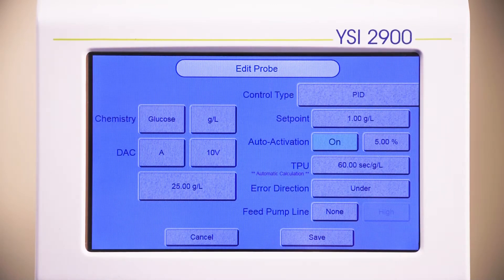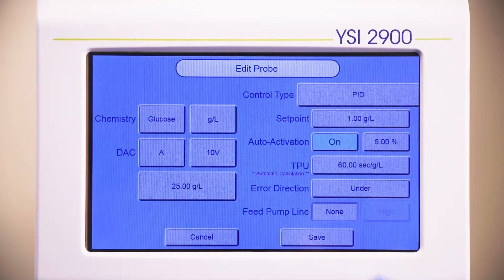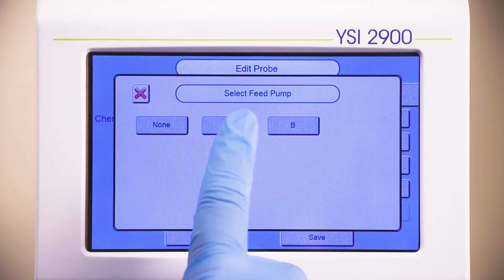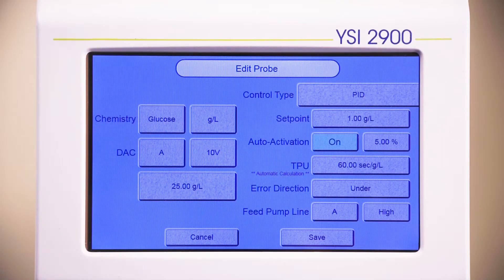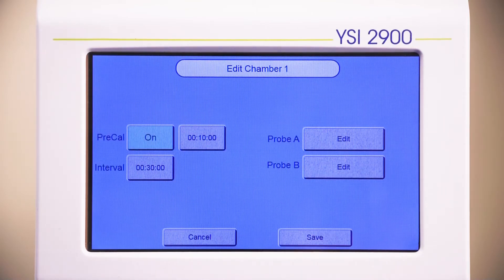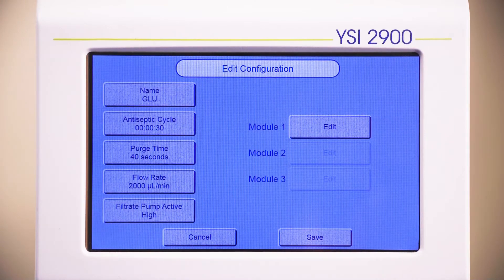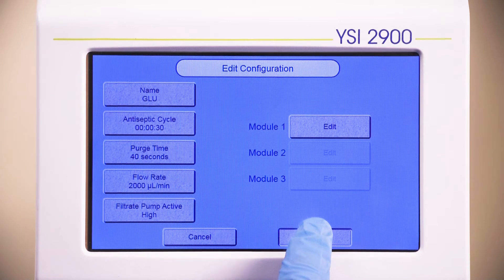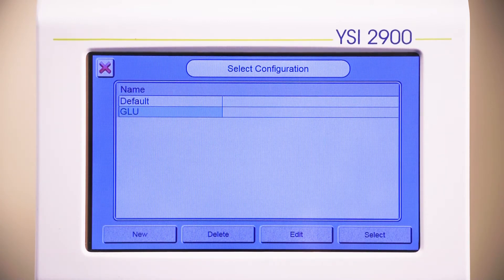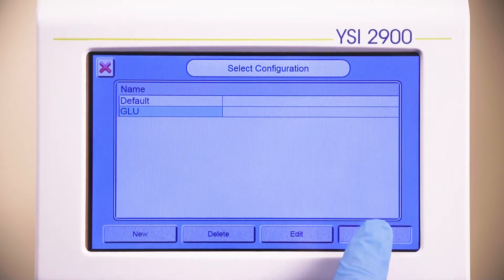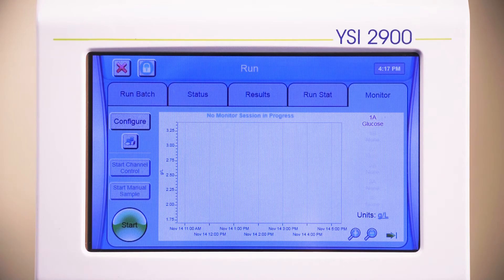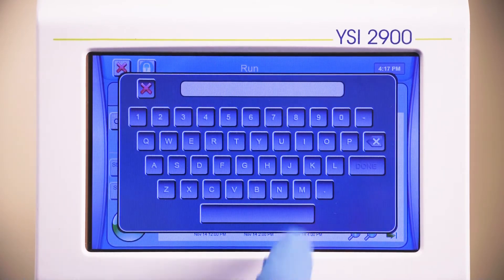Leave the error direction set to under for this example. Press the button next to Feed Pump Line and select Output A or B. Select High for your output signal and press Save. Now your monitor and control routine are set for Probe A. Press Save to save the probe configuration, and press Save to save the monitor configuration. Press Select to select the highlighted configuration. Press Start and enter a name to start the monitoring and control session.